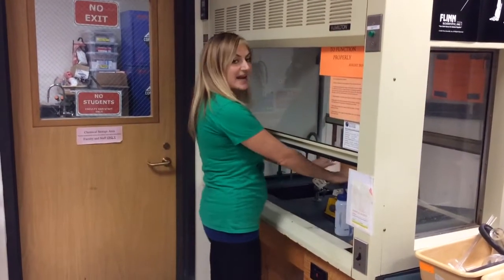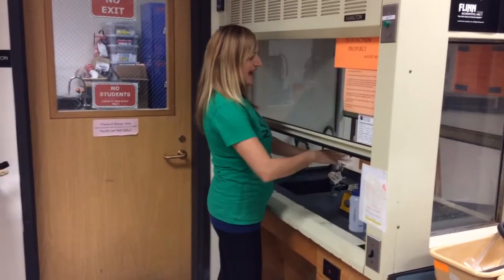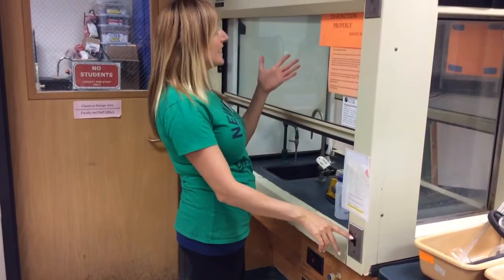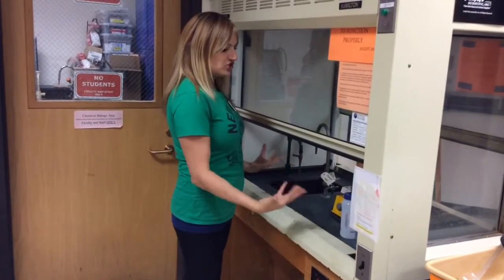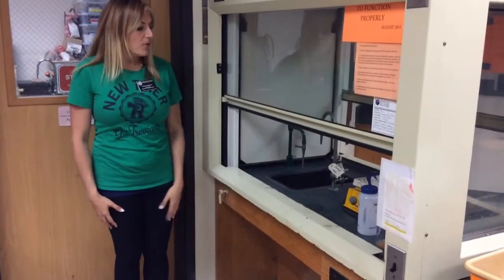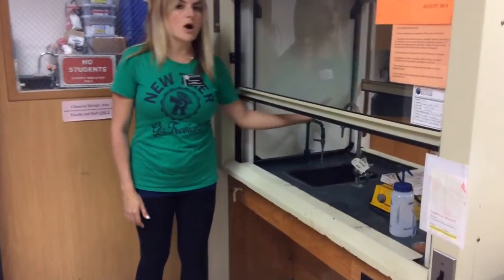Never put your face under here. Instead, your hands can go here and you can watch what's happening through the glass. Over here is the switch to turn the hood on. It will then turn the light on, and the fan should be generating as well. A few things that are under the hood that are important are 2 water faucets.